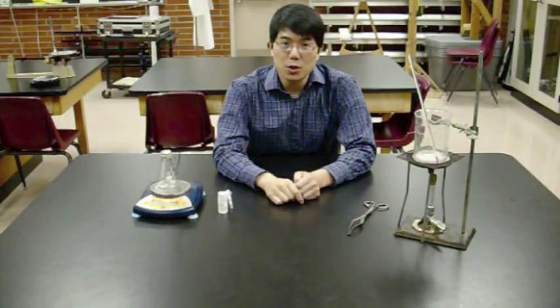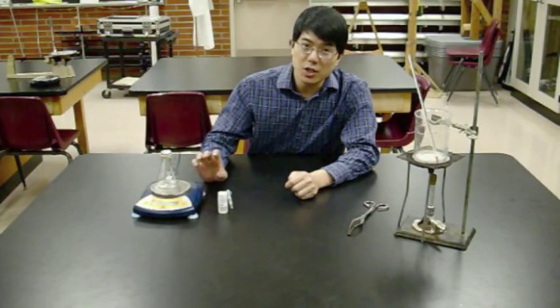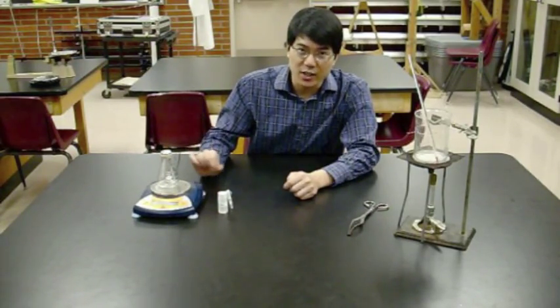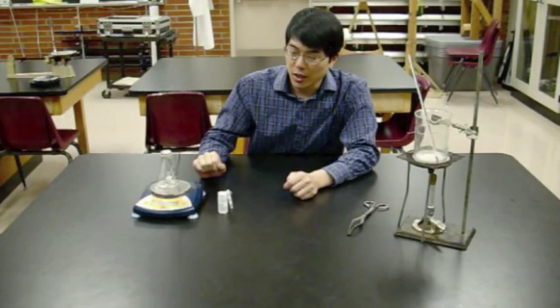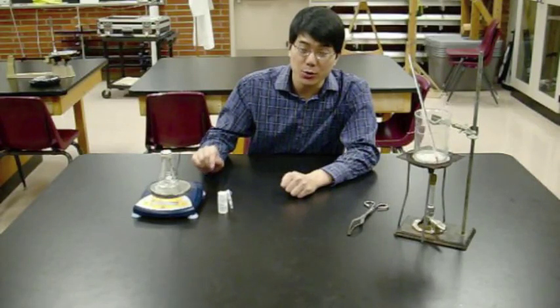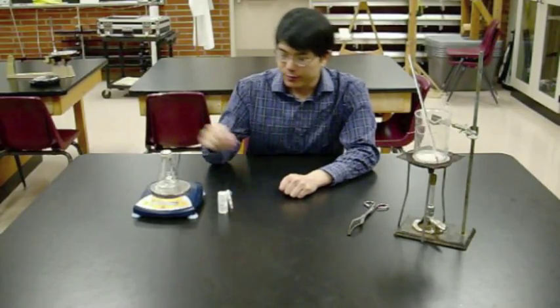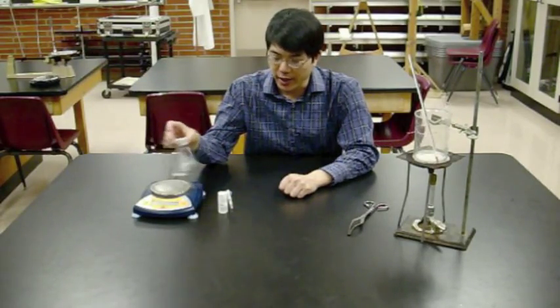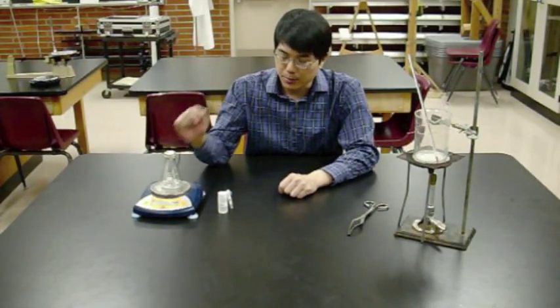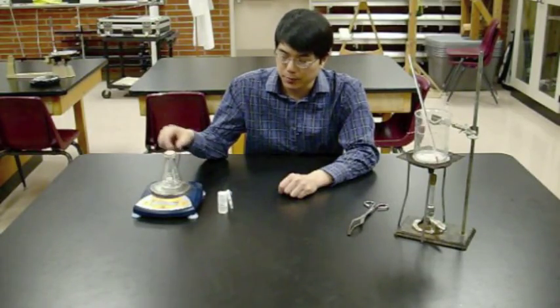Weigh your Dumas tube on an electronic balance. You want the added accuracy because you're looking at very low changes in mass. You have to get a mass measurement before you put any unknown in there. Otherwise, you'll never be able to analyze your data. This first measurement is just your Dumas tube full of air, no vapor, no unknown.